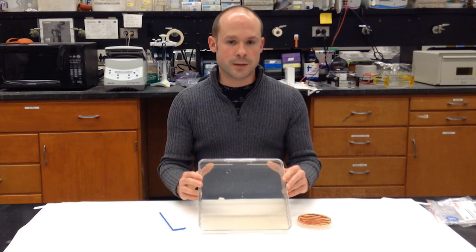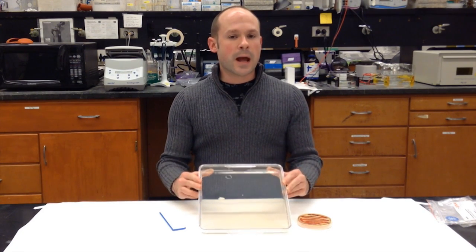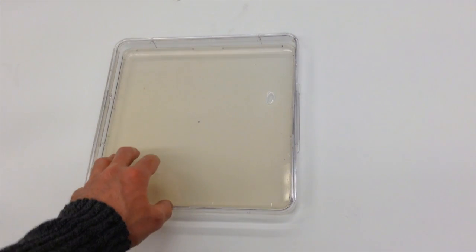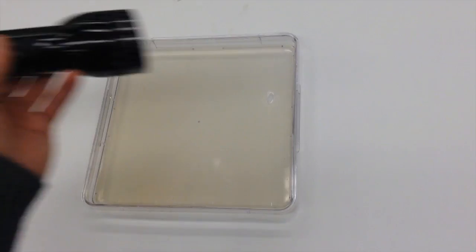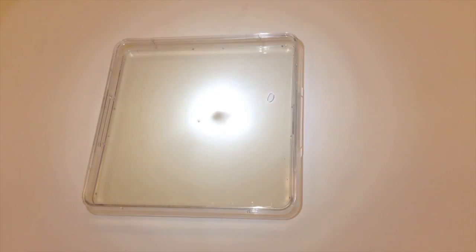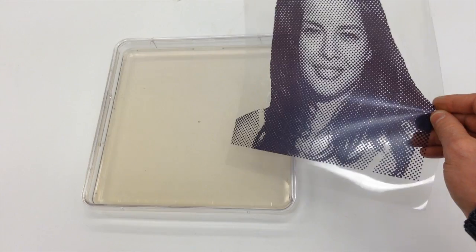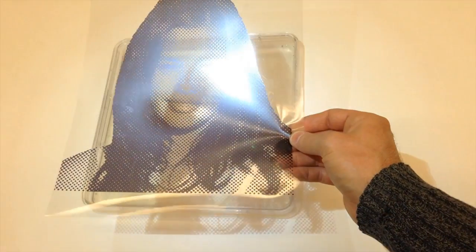Once I have this covered with bacteria, then it's time to expose it to radiation. That part happens in a special exposure unit so I can't actually show it to you, but I'm going to reenact it with some props. This petri dish represents the petri dish after it's been covered with bacteria. This flashlight represents a radiation source — think of this light as deadly radiation. And this transparency is going to serve as the negative. So I cover the petri dish with bacteria, then I put the negative on top of it, and I shoot radiation through it.